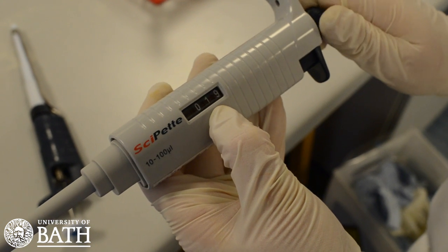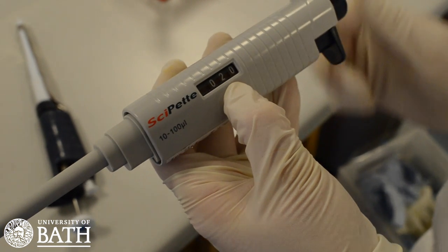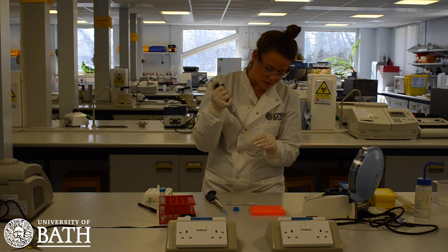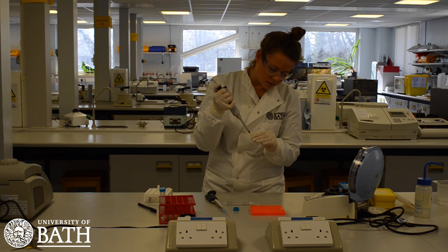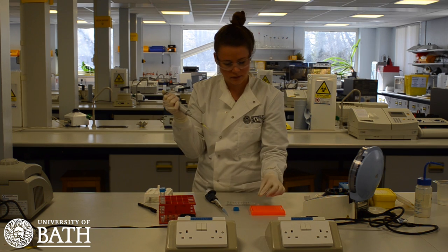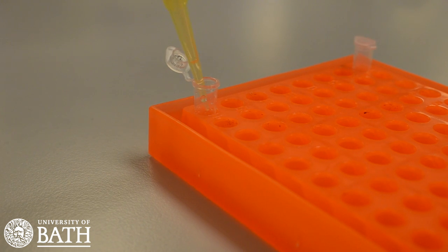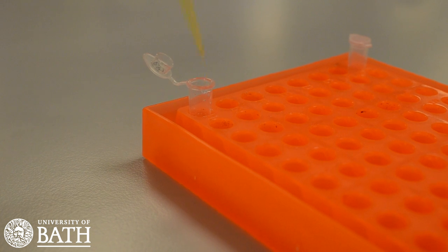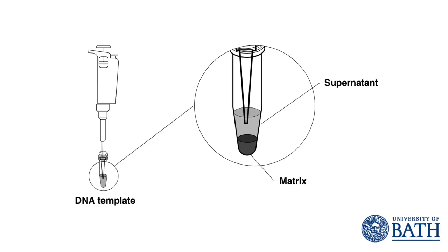Next, using a suitable micropipette, remove 20 µL of supernatant from the microcentrifuge tube containing your DNA template that was prepared in the previous lesson. Transfer your DNA into the PCR tube labelled with your initials. Note that it is important not to transfer any of the matrix beads into the PCR tube, as this will inhibit the PCR reaction.